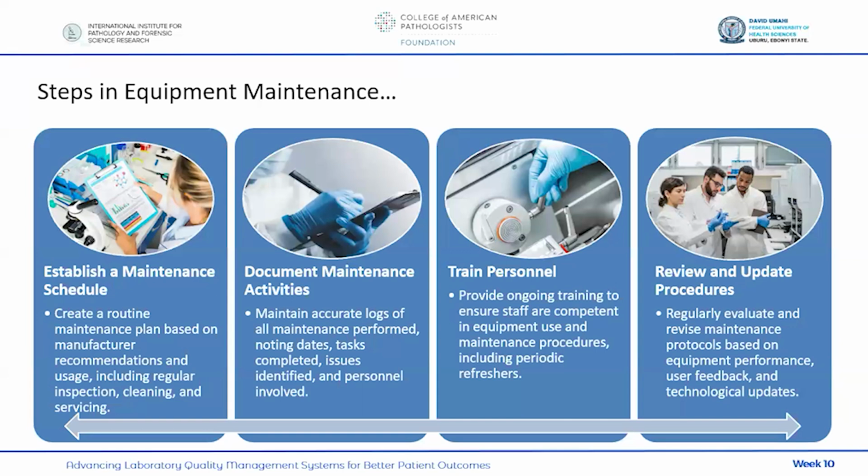Because an equipment which runs, let's say 10 samples in a day, you can't compare that with an equipment that runs like 50 or more samples in a day. Obviously, the heavier the load the equipment carries, the more regular the maintenance should be, okay? And this maintenance plan should include regular inspection, cleaning, and servicing, okay? We've mentioned it before that the maintenance plan is not only about when you invite an external engineer to come, that is included. But in addition to that, the lab personnel who handles that machine, there are some daily maintenance things that he does on a regular basis, like cleaning, minor servicing, and all that. Okay?